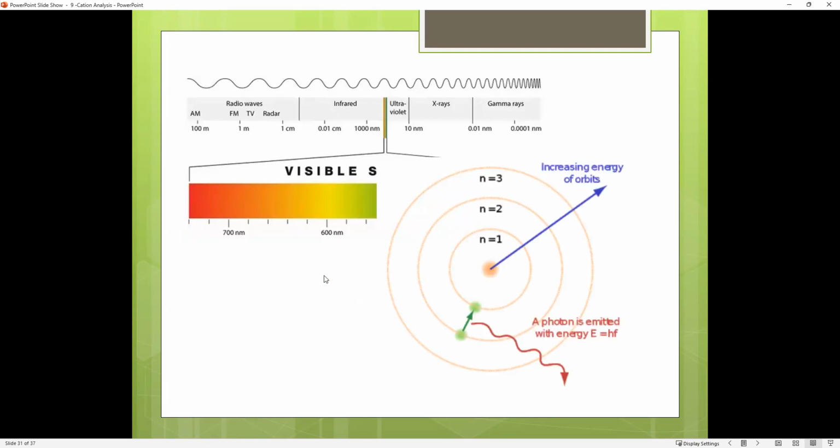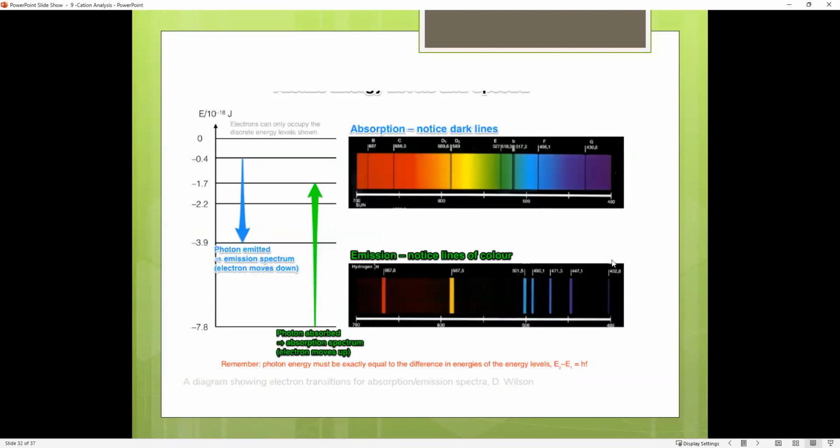So what's happening is I'm bubbling a metal salt through there, and it's going into the Bunsen burner, and the Bunsen burner is heating it up and going to excite the electron. And as the salt moves to the cooler part of the flame, it's going to fall back down in energy and give off a photon that corresponds with the energy change. And we get these really sharp lines for atomic spectra, and we can look at emission, or if we have the metal salt in the vapor, then we can look at absorption. And this is how we can detect in clouds and other planets and on the sun what elements are there.